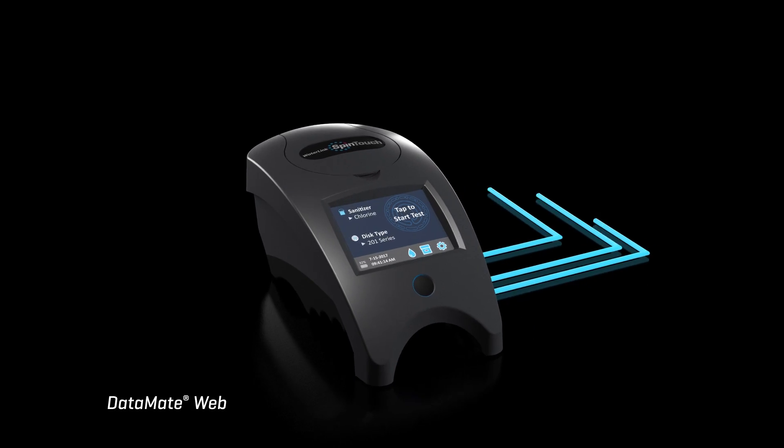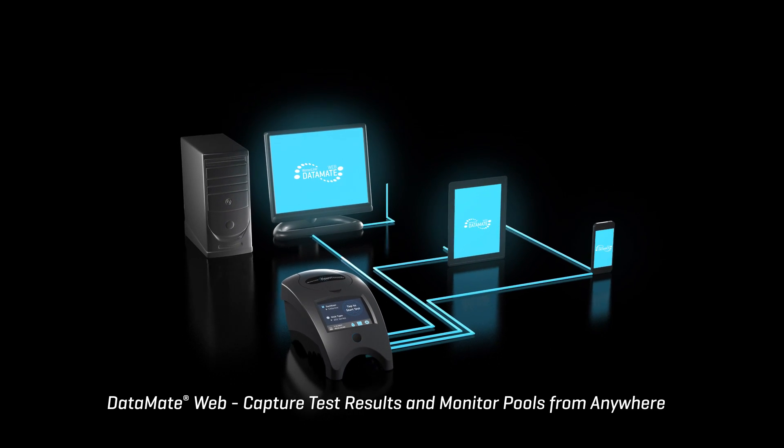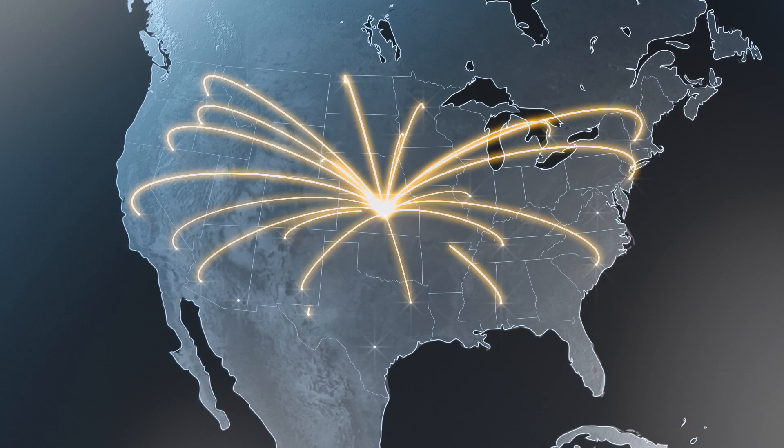With Datamate Web, the WaterLink Spin Touch seamlessly provides the time, date and test results for remote monitoring anywhere in the world. Hotel chains to service companies can now have eyes on pool water anywhere, anytime.